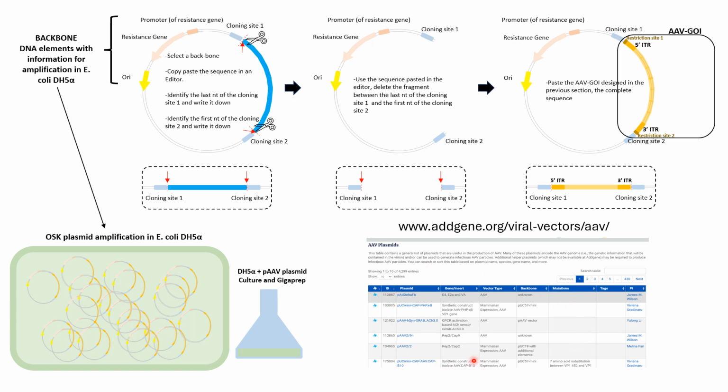By typing this, you will get to this website, and in here you can see many backbones, but the majority of them are exactly the same. This region that you see here is exactly the same for the majority of them, so you can use any of the plasmids that you will find here, because what the people are doing is exactly the same. They use this backbone, they introduce the genes, so you will find here a lot of different backbones with different genes, so you can use any of them. Okay, so let's go to see how to get the backbone sequence in this website. Let's go for it.